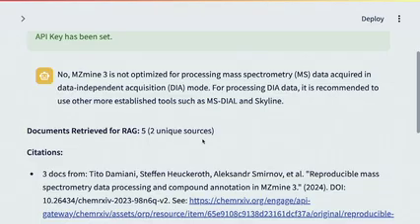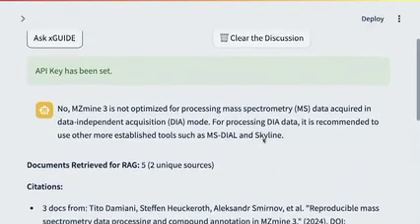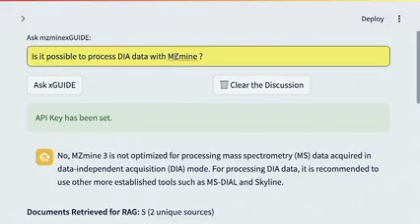Can we? So we do have like an experimental workflow for this, so it's quite new. And so it kind of makes sense because maybe the answers are also sourced from the issues. And in most of the issues, we then point people to other software and saying that maybe use this software now. So it's also some like old information sometimes. So we would also need to see like the other. And yeah, like DIA, we're really just integrating now more and more. Okay, so that one was a success, let's say.